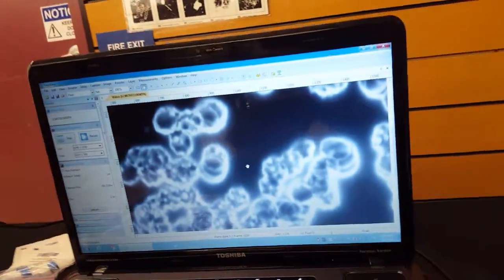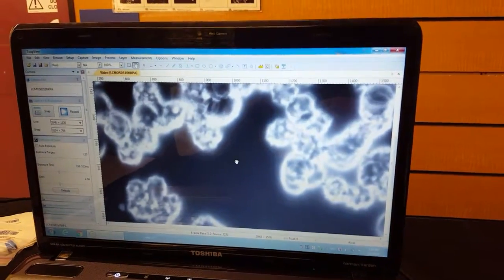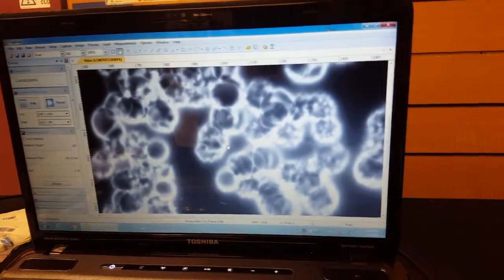But let's see. Now see how the cells have stopped? They've slowed down now. They're not quite as happy as they were. But I know that's kind of normal, you know.